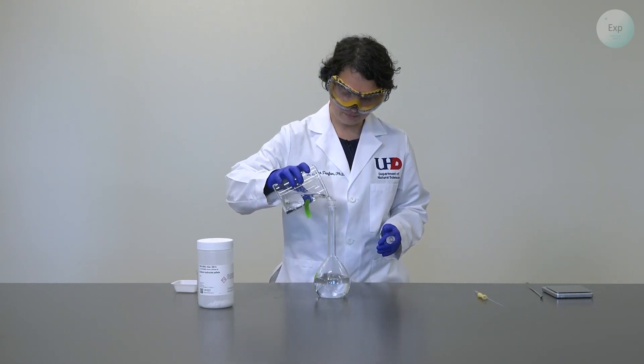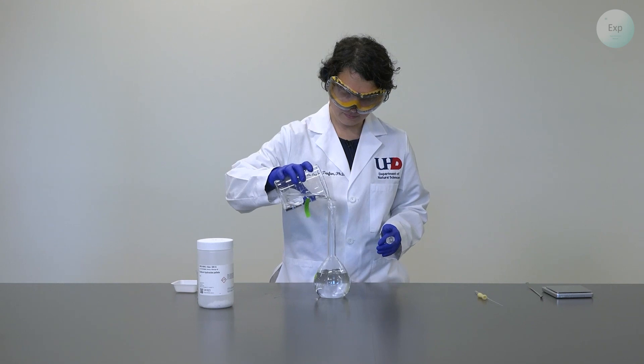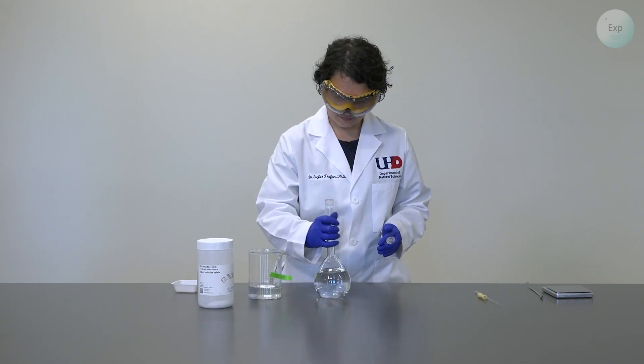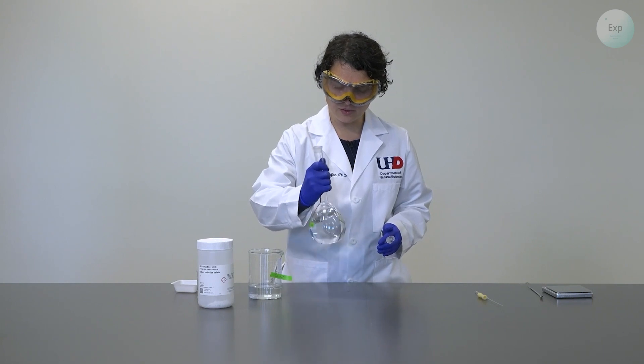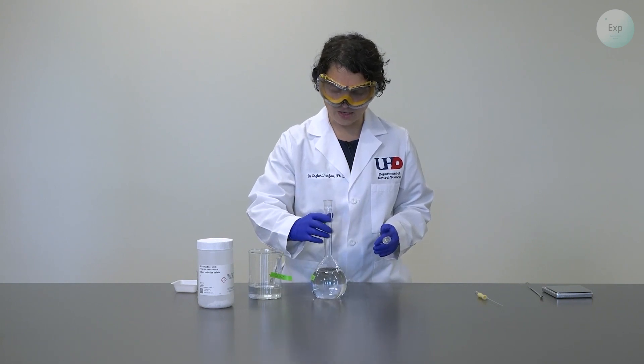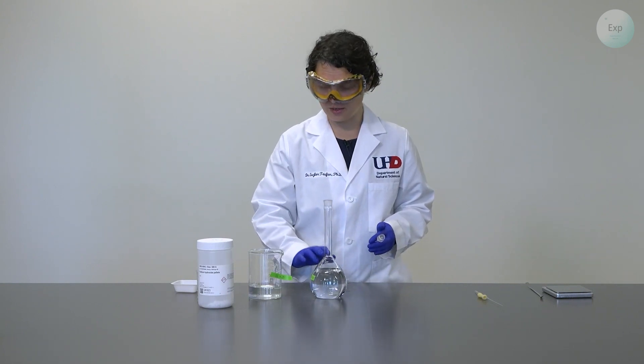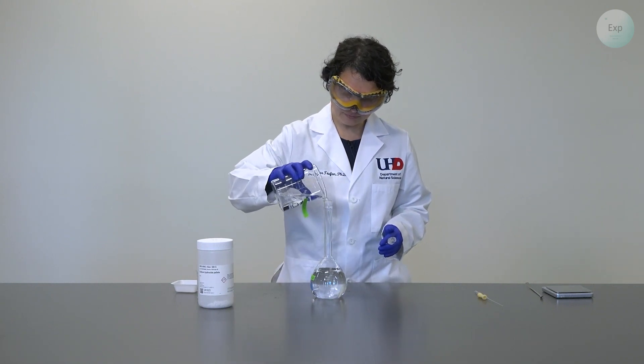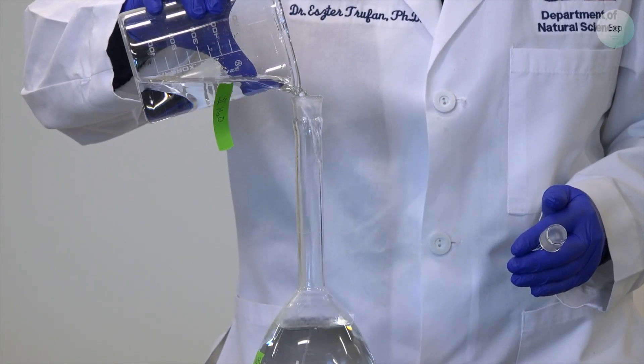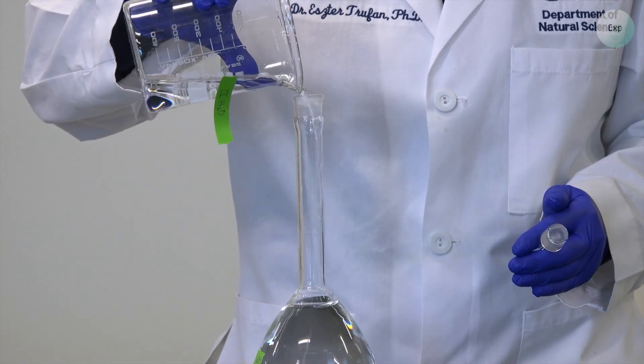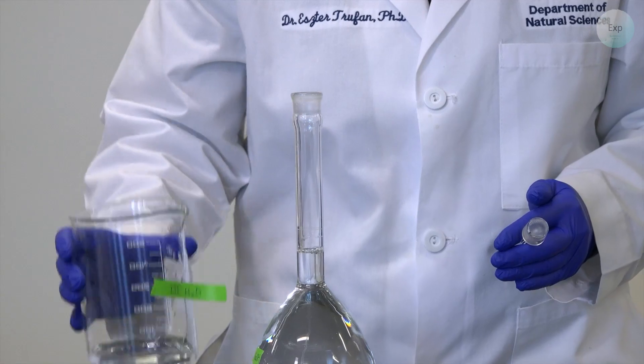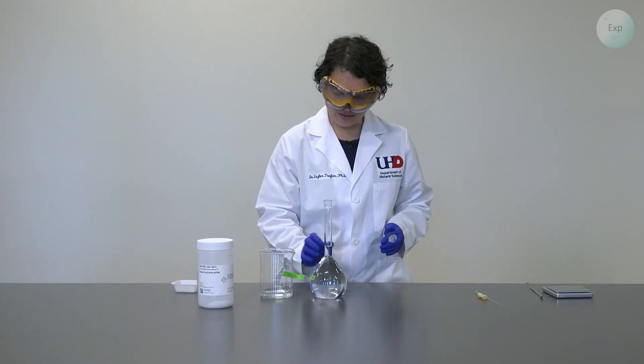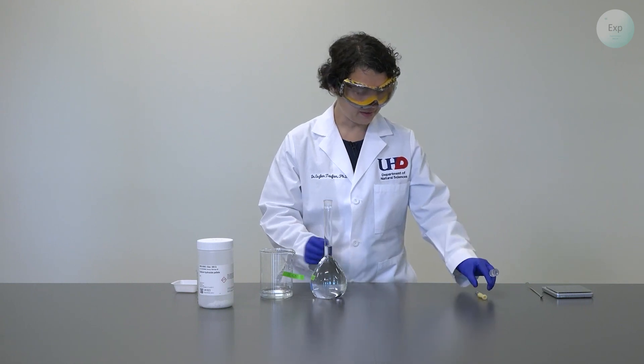Then we add more. And you'll notice that the closer you are to the neck, the more challenging it becomes to swirl the volumetric flask.